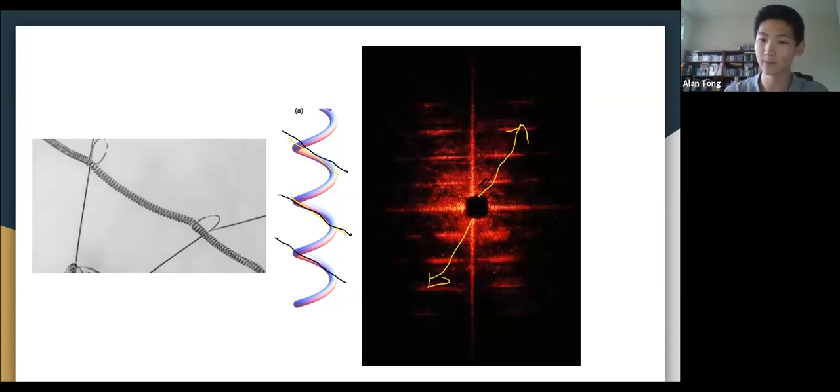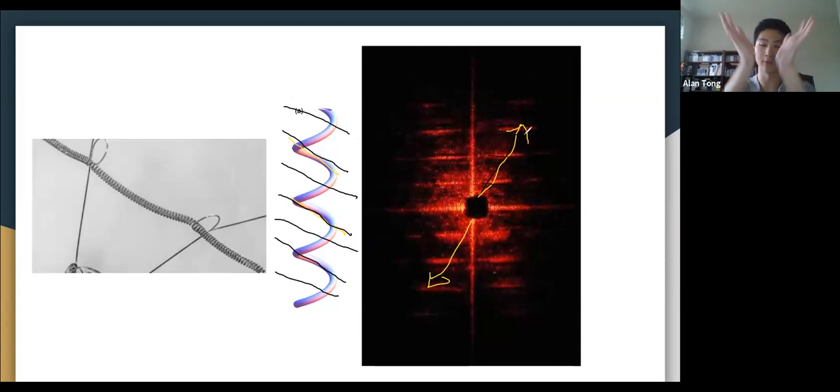Now, why are there different spacings? Well, there are different spacings because you can draw these planes, maybe not like that, you can even draw planes like this. You can double the frequency that those planes occur in. Why not, right? So each of these spacings also gives you different layers of your planes. And of course, the angle is the same because the planes are oriented in the same way.